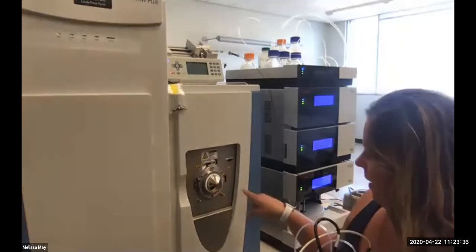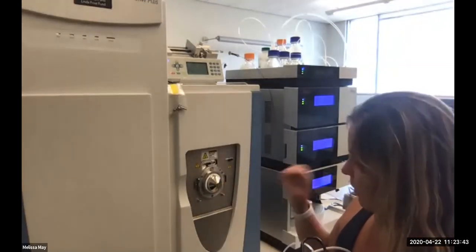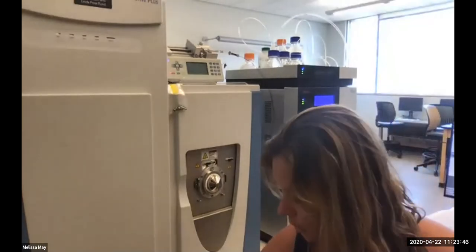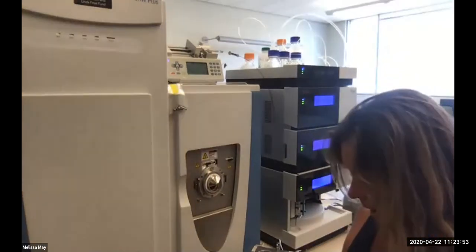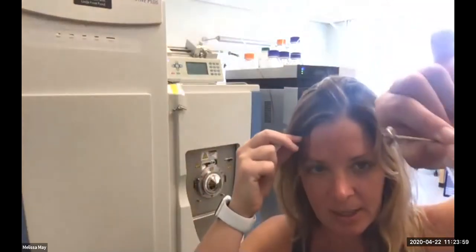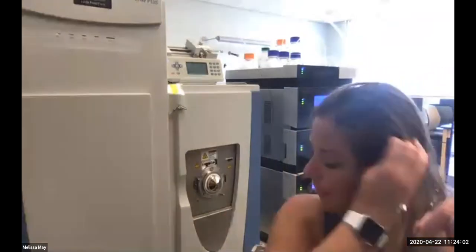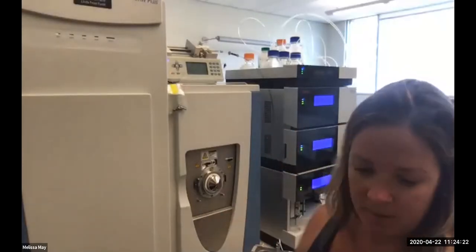Right here, we have the spray cone, and this little tube that goes inside, where the sample actually gets injected, is called the ion transfer tube. The ion transfer tube gets dirty and occasionally needs to be cleaned. It's this long pin that sits inside the instrument, so this is our extra one. About once a week when you're calibrating the instrument, it's also a good idea to take this out and clean it, using a methanol water bath and sonicating it for 5 minutes. I'll post another video showing general maintenance, but that's the general setup.